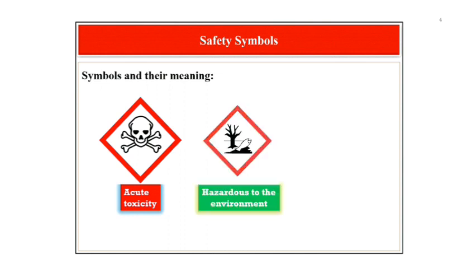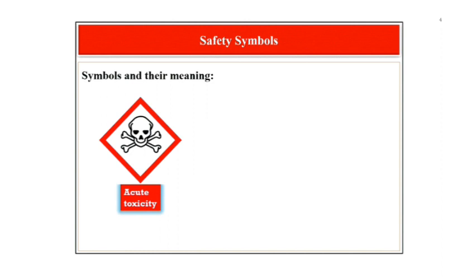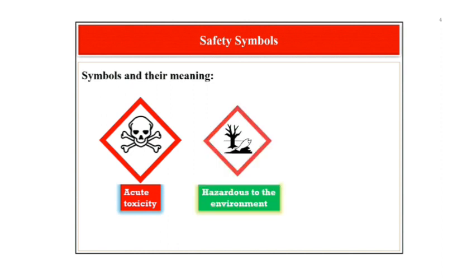The next symbol is the symbol for hazardous to the environment. This symbol includes a dead tree and fish. It indicates that these substances can cause damage to the environment and is most often used to label chemicals that are toxic to aquatic wildlife. These chemicals should be disposed of properly and ensure that they do not get washed down the drain.